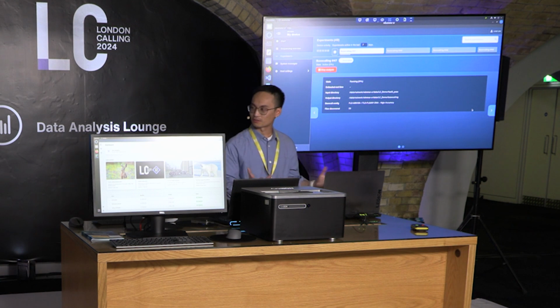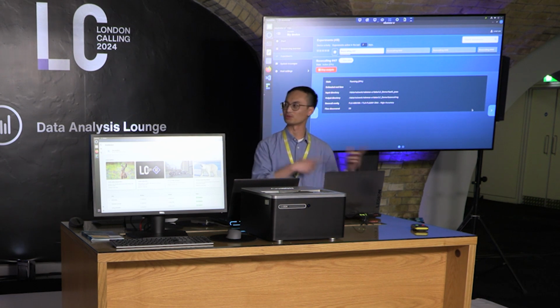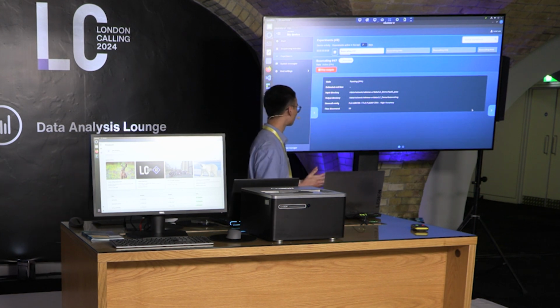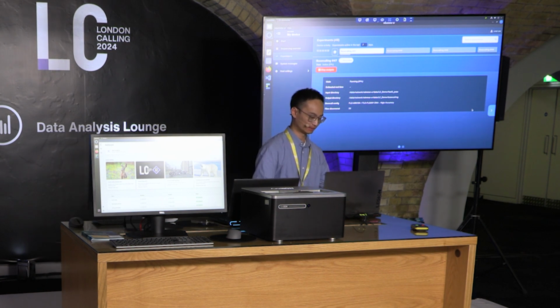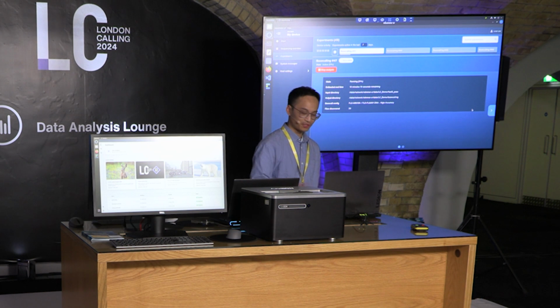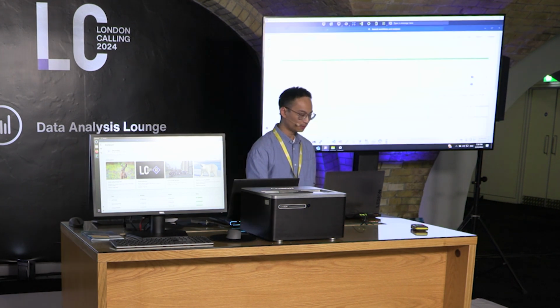And so it's going to take a couple of seconds for it to warm up. Once it starts to generate the base calls, then we'll switch over back to the EPI2ME application. So hopefully this doesn't take too long to warm up. Okay, so we're starting to see some estimated time, which indicates that base calling is now happening. And so now we're going to switch over back to EPI2ME.